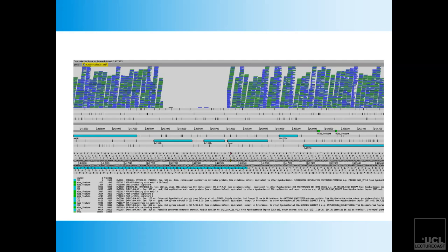You'll see the nanopore, and we'll show you later on. With the Illumina, you can see that they're in really tall, thin stacks. With nanopore, because we have longer reads, it's more of kind of blankets almost. So they look similar but different, and that will be the comparison. And each one of them, you should also realize, has got advantages and disadvantages. So the two actually complement each other. Any more questions?